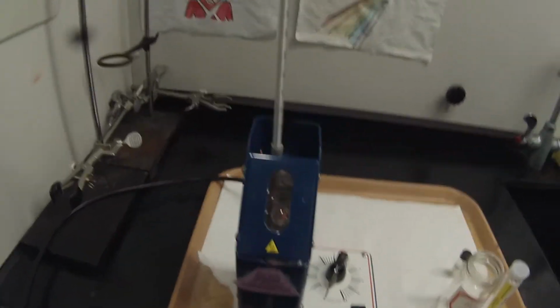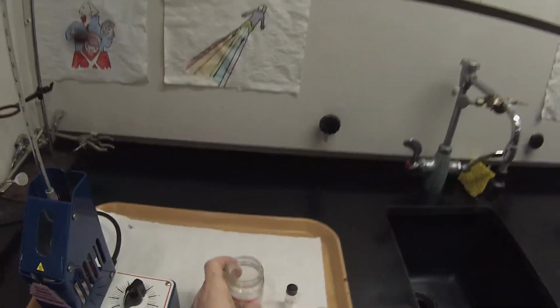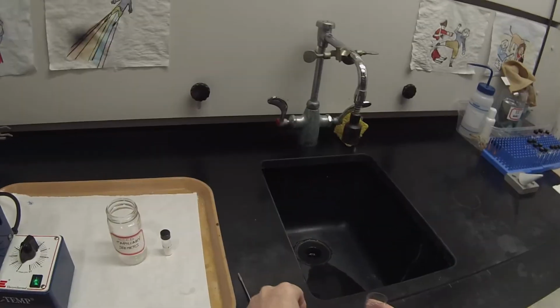So I brought a melting apparatus into the lab and stuck it in my hood. I'm going to turn that on. I'm going to grab a chair. So unfortunately, the melting range of the possible Aldol products is quite large. The potential range is everywhere between under 100 degrees to almost 200. And I want this to be rising at about 2 degrees C per minute at the melting point. But since I don't know which one of those compounds I have, I don't know how fast I need to let it rise. So we may be here a while.